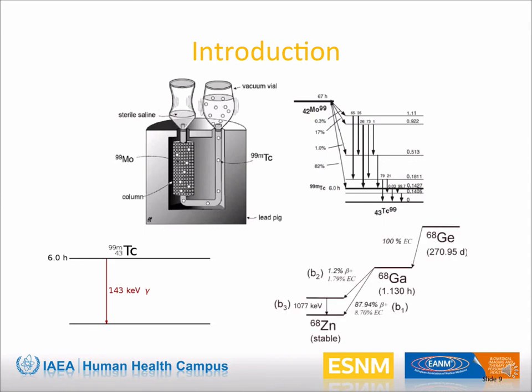As mentioned, germanium-68 is also another generator. We have the germanium-68, which decays to gallium-68. However, the gallium is eluted with hydrochloric acid and not sterile saline like for the technetium-99.